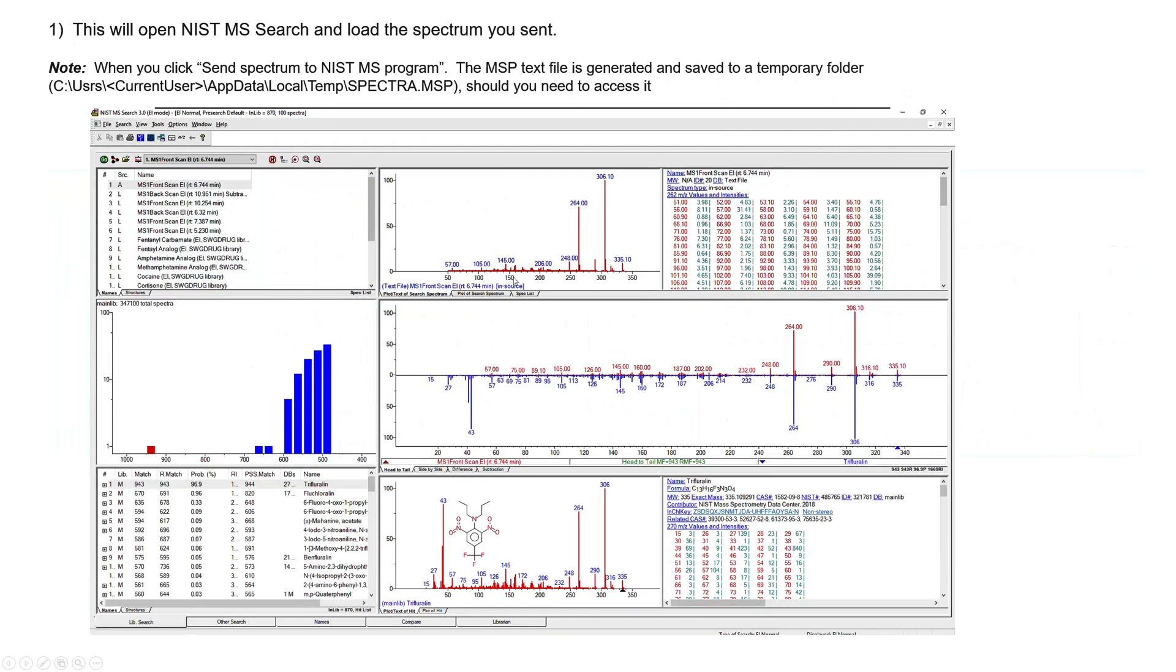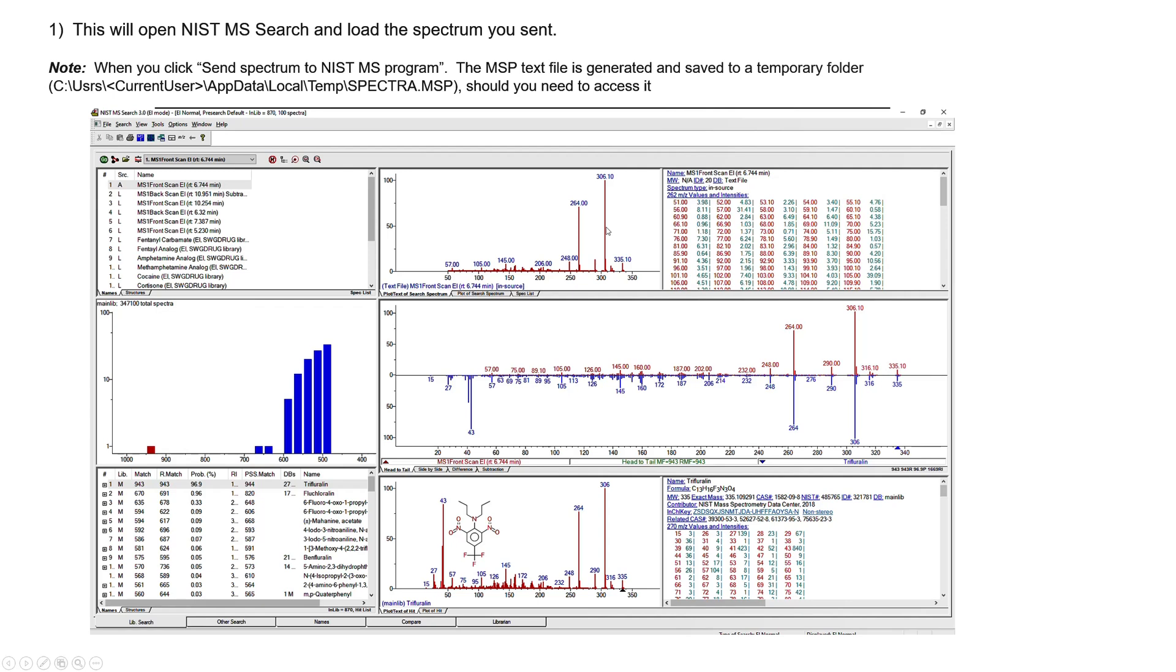And when you go over, it'll automatically open up the NIST MS search and do the search. And the commands to do this, it sends to the clipboard somehow, and I put a couple of details about how it actually works mechanically. Basically, it just sends it over and does the search. This is actually an MS MS spectrum, I believe. It's in-source, but it's MS MS as opposed to EI, but it could do either.